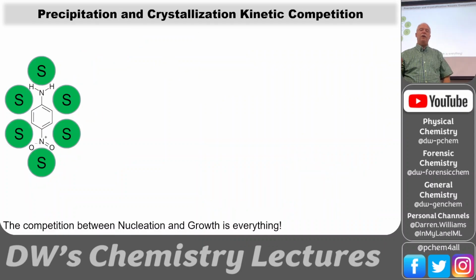So let's talk about what causes these particles to grow. So I'm going to show you, this is from research that some of my students did a little while ago, where we were looking at the Hansen solubility parameters to see if we could change the shape of crystals. So the different crystals that we get are all the same chemical species. They're all nitroaniline, okay? But you'll see the dramatic differences in the shapes of the crystals that we get. So let me just back up a little bit and talk to you about how particles crystallize or precipitate out, okay?